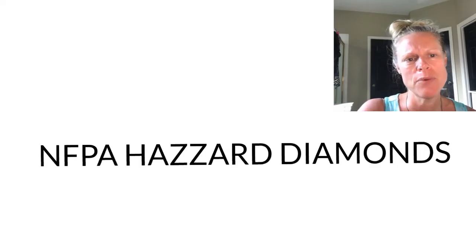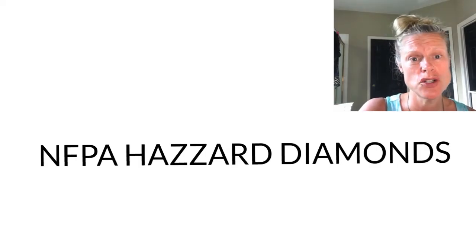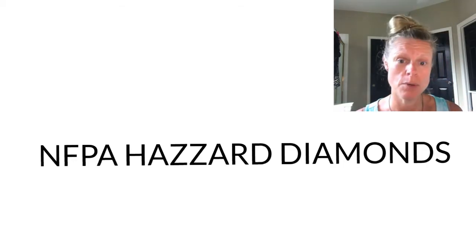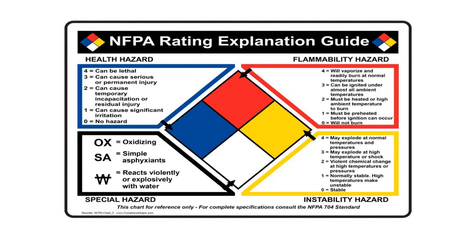The NFPA was a company brought about in the late 1800s that wanted to make the working environment safer so people could understand the hazards of different chemicals. Let's look at the basic layout. Here's the basic layout of a safety diamond. Always, always, always it'll be these colors in this order. The white will always be at the bottom, the blue will always be at the left, the red's at the top, and the yellow is over to the right. That is very standardized — it does not change.